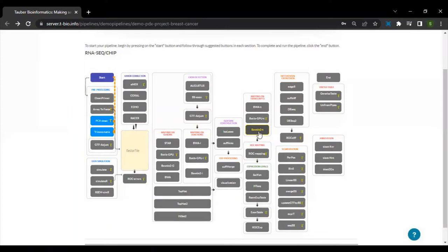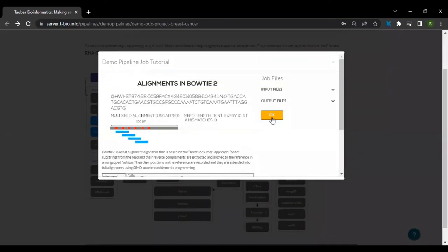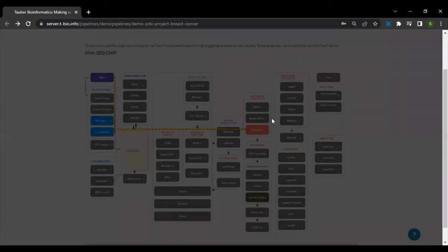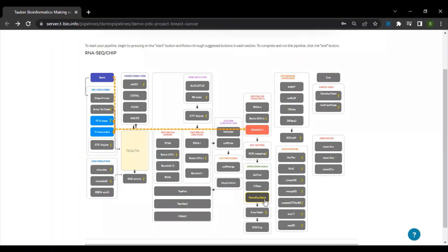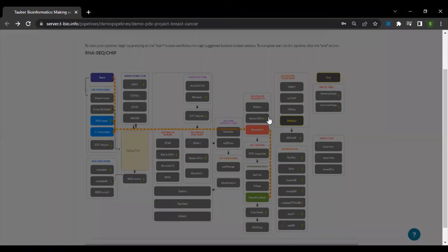Then we have the VOTI2T algorithm for mapping on the transcripts and RSIM expression table for quantifying gene and isoform abundances.